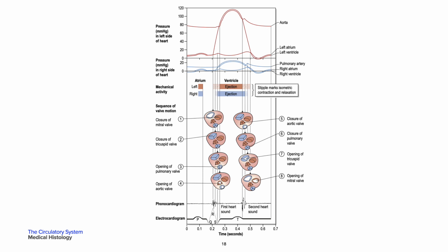The bundle of His and the bundle branches. We have the Purkinje cell, a term applied to all the cells in the left bundle branch and distal right bundle branch because they are larger than the myocardial myocytes and feature cytoplasm that is more vacuolated. As with all the conduction system cells, the Purkinje cells are myocytes. They also contain myofibrils by EM, and differ from normal cardiomyocytes in the absence of T tubules and a striking abundance of cell-to-cell junctions.